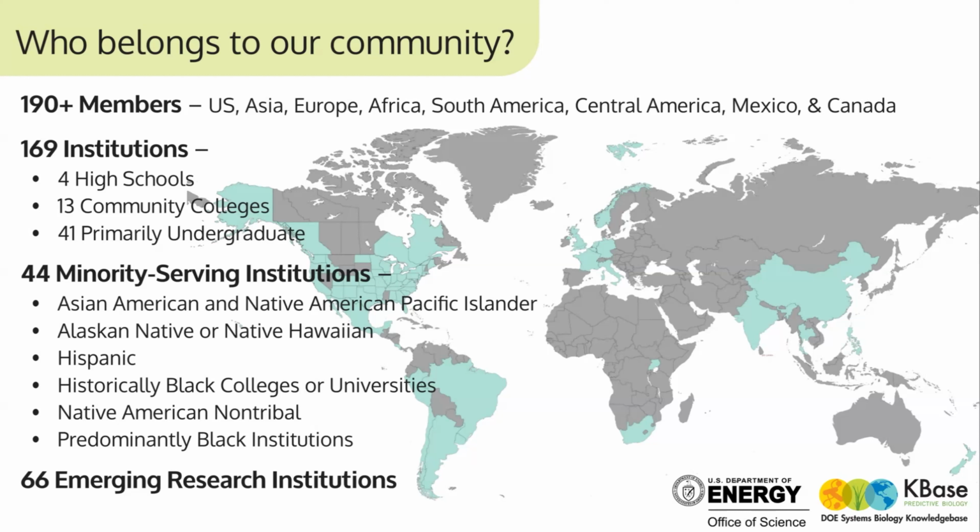It's really great that we can have such outputs, and while they're looking at functional diversity, whether nitrogen and so on, it's good to know that it's there, but they should also test for significance.